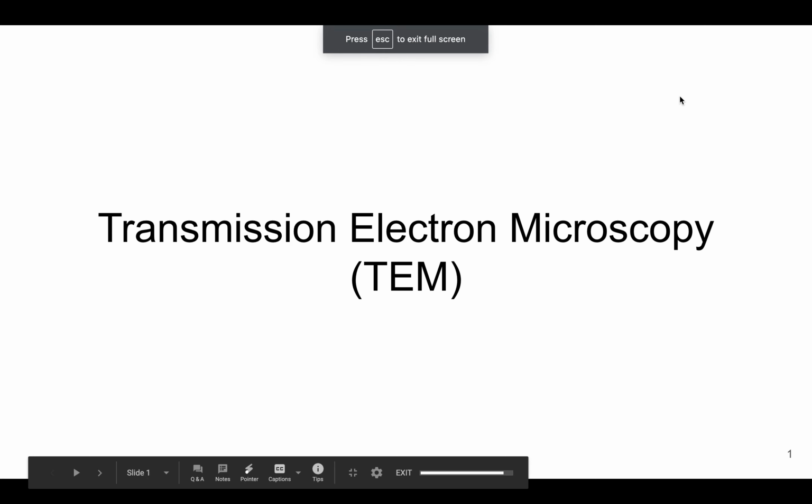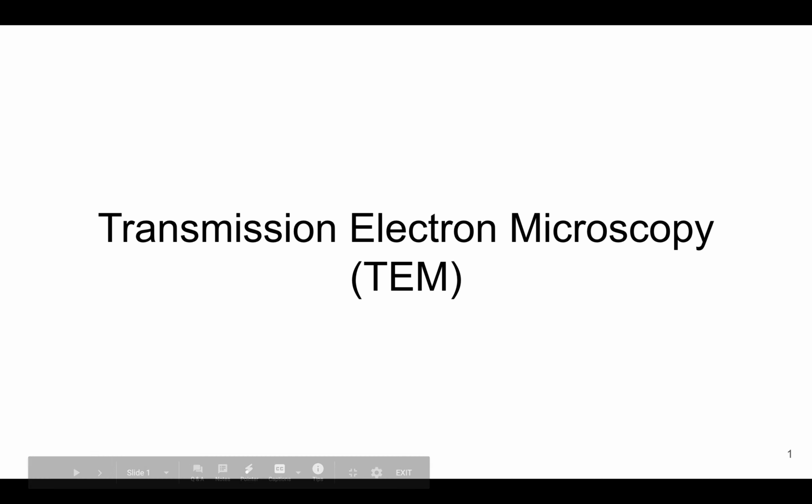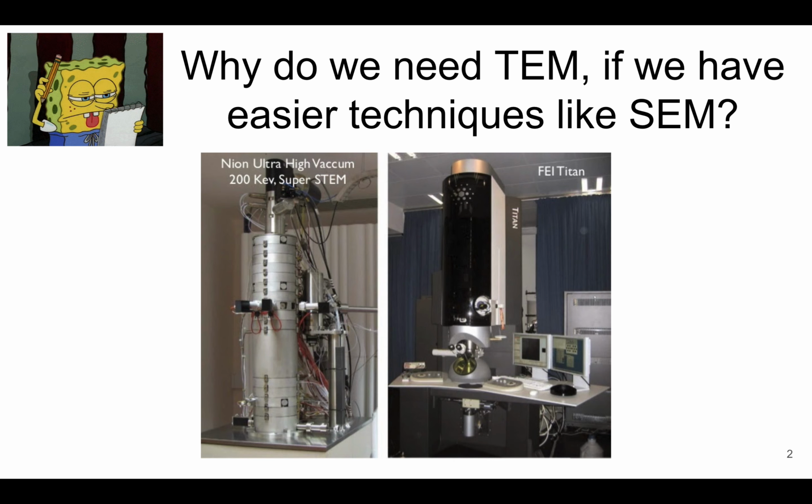All right, in this module, we're going to start looking at transmission electron microscopy, or TEM. So before we do anything, I want to ask you a question. It's on the quiz. We have talked about SEM, and we talked about how it's very common and easy to use. So with that in mind, why do you think we need TEM? Brainstorm some ideas, what you know or what you may not know about TEM, and see if you can come up with why we need TEM when we have something like SEM. So answer that, pause the video, come back, and we will discuss.